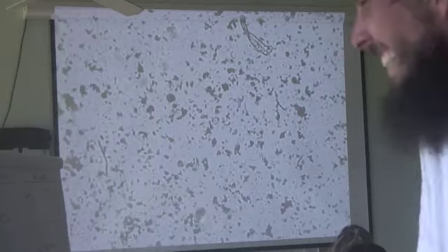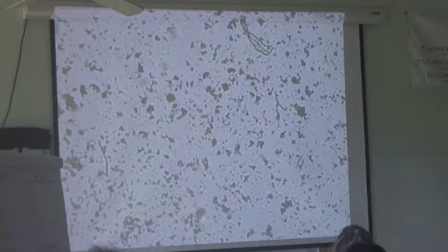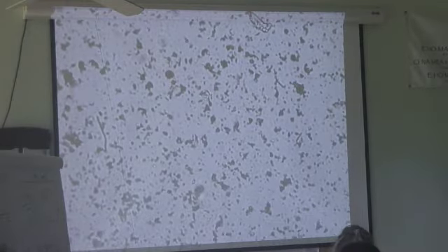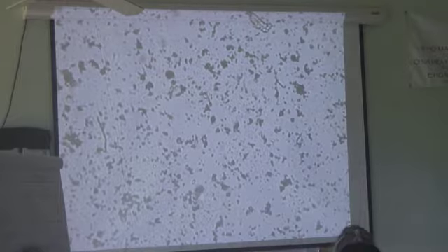So now, right, it is much more smoother moving. We call them the race car drivers of the soil. Mario Andretti. I'm going to see if I can go up in magnification and get this guy. So this is my 4X. You'll notice that when I move to my 10X, I'm seeing a lot less of the field, but everything's much higher in magnification. So there's our guy right there. Can't see cilia on yet. So he's just kind of hanging out and having a good time. So I'm going to go up to the 40X.